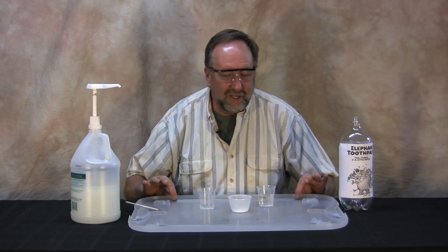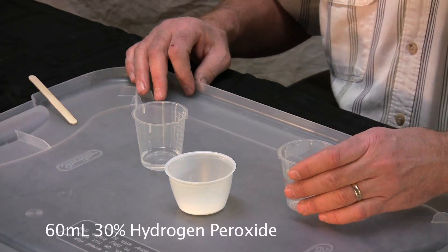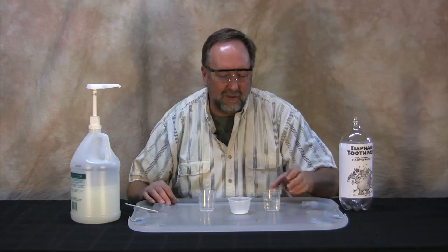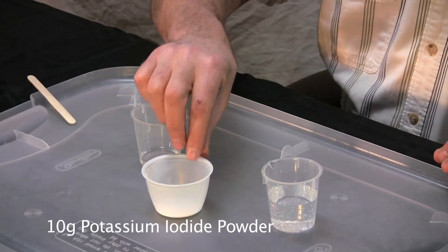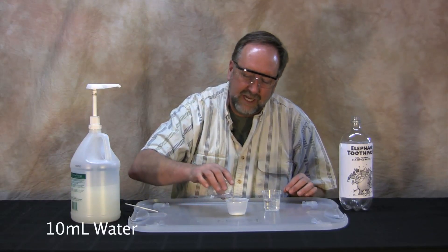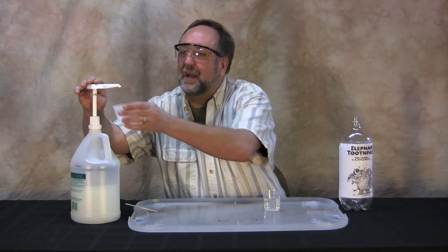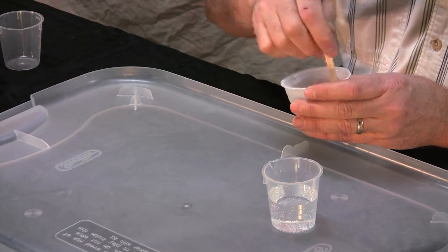First thing you're going to want to do is get a tray to catch the mess. Now, the star of the show is hydrogen peroxide — this is not the stuff from the grocery store or pharmacy, it's 30%. You need some potassium iodide, which is a white salt, and a little bit of water. 10 milliliters of water, 10 grams of potassium iodide, with a squirt of soap — stir that up, and that is your solution.